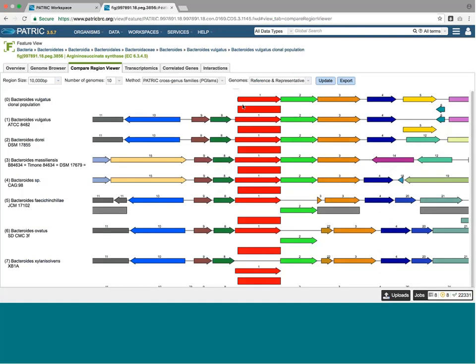And here you can see this particular feature is at the end of the contig, and the box only matches part of this closest gene, and we have similar colors here indicating a similar neighborhood, but only in one direction.